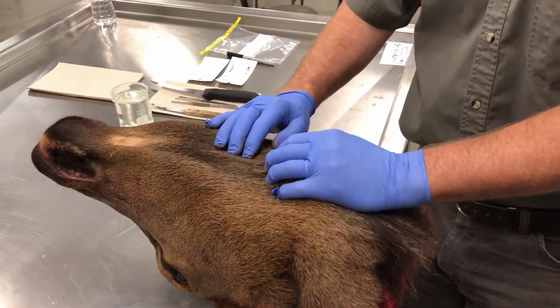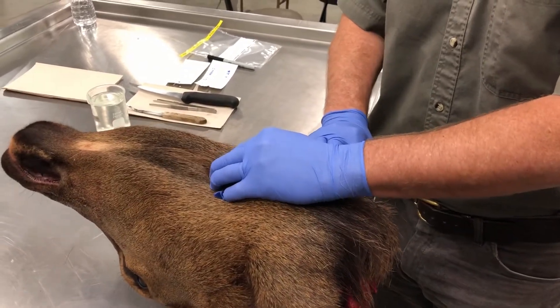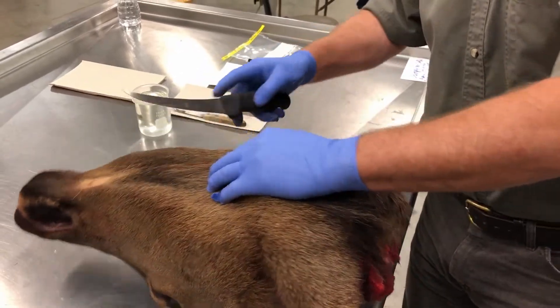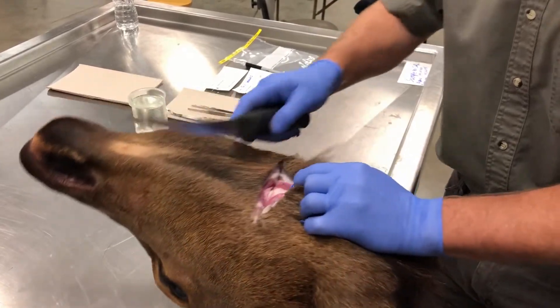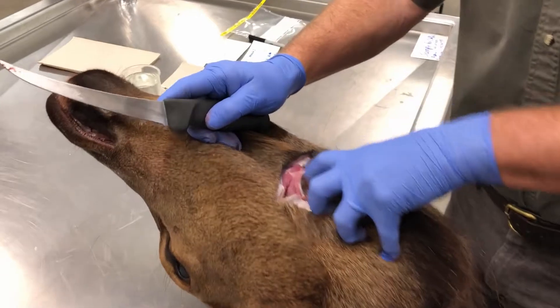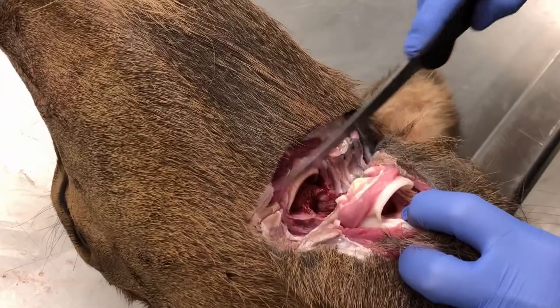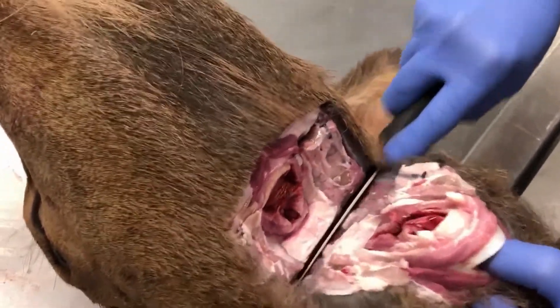To find the retro pharyngeal lymph nodes, the first thing you want to do is feel down until you feel the larynx, which is a bump here on the throat. You're going to take your knife and right in front of the larynx, make a cut down into the throat. You can see the larynx is right here — reach in there, grab that, and cut down through. When you get through the windpipe, make an S-cut back and then down.